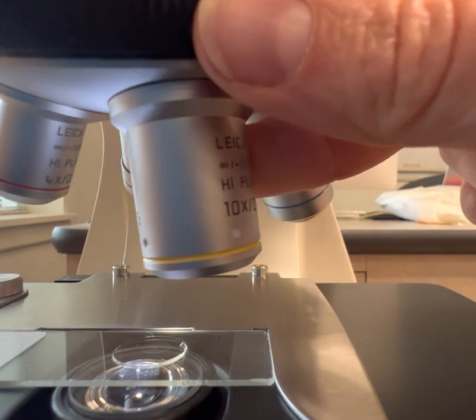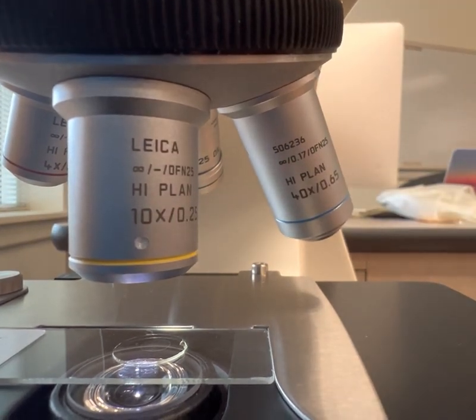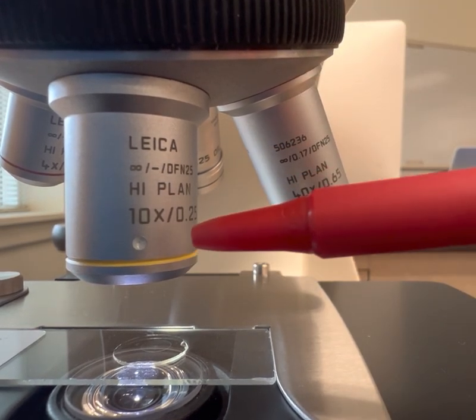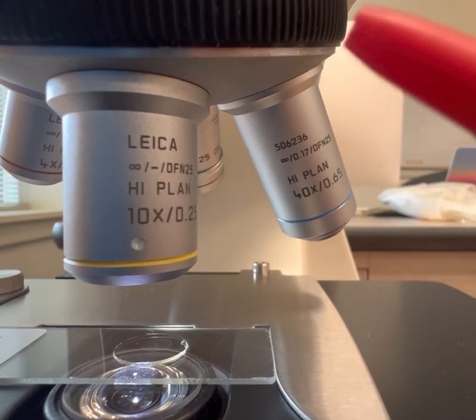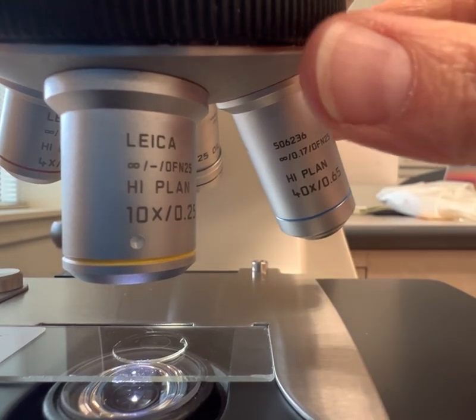As you go up in magnification, so now I've gone from 4 to 10, as you go up in magnification, your field of view shrinks. This is the low power. It is always yellow on my microscopes here, and it is 10. So 10 times the naked eye with this objective, and then if you place it up with the ocular that you're looking through, you have 10 times 10 for a total of 100 with this objective.